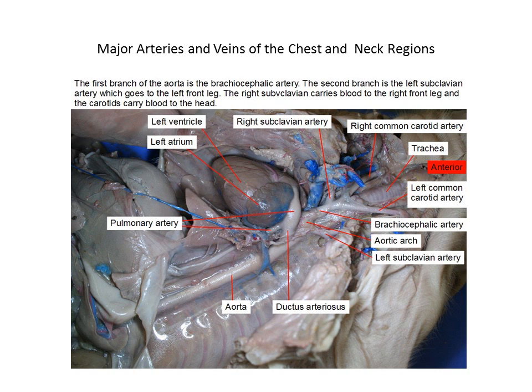You're going to have to clear away a lot of connective tissue to get to the various carotids, jugulars, subclavians. The subclavians are the ones that service underneath the clavicle obviously, but the carotids and the jugulars go to the head. Make sure you can find all the external and internal ones. Make sure you know about what distance is which so you could identify the difference given a practical examination.